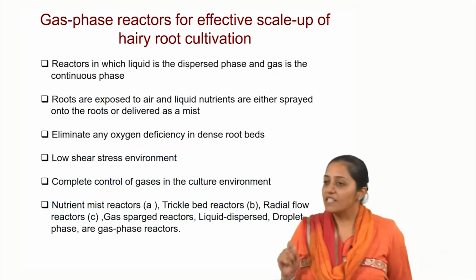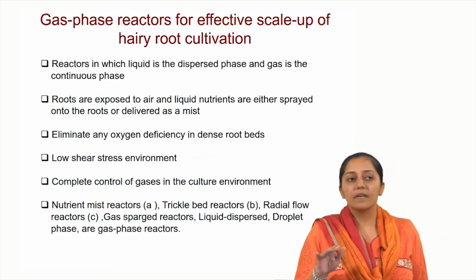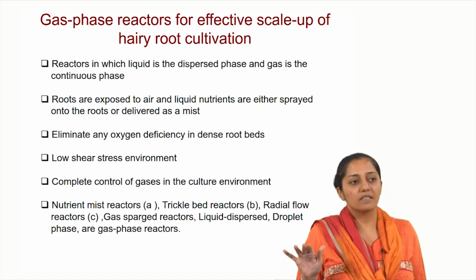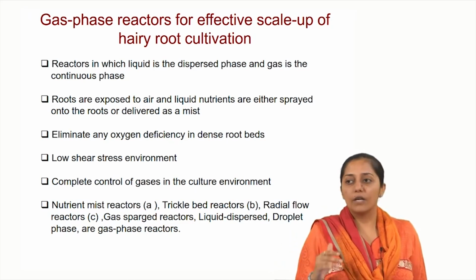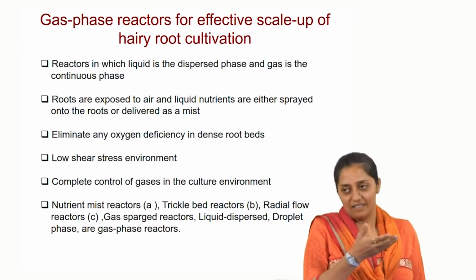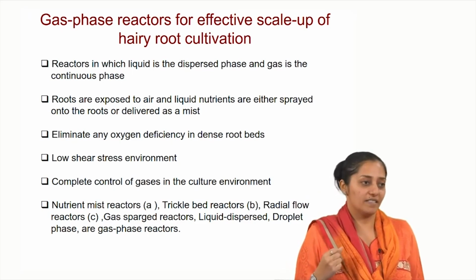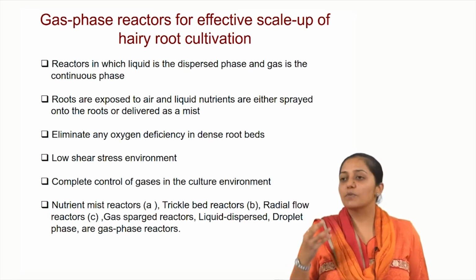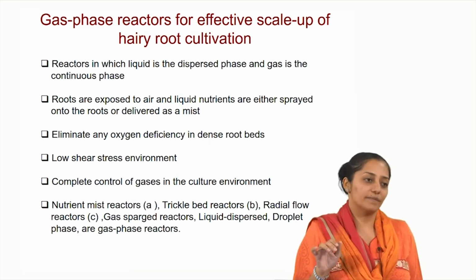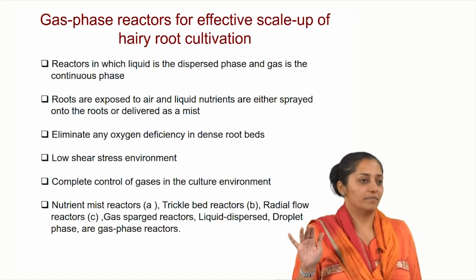So, what are gas phase reactors? I said the reactors where a liquid is dispersed into the gaseous medium. Can you guess? Liquid being dispersed into the gaseous medium, like for example trickle bed reactors or mist bioreactors, where the media was provided in the form of cloud and mist onto the roots, and the roots were kept on the support system.